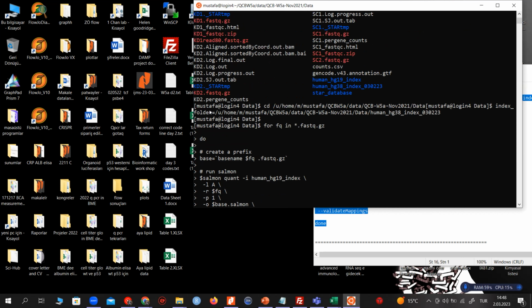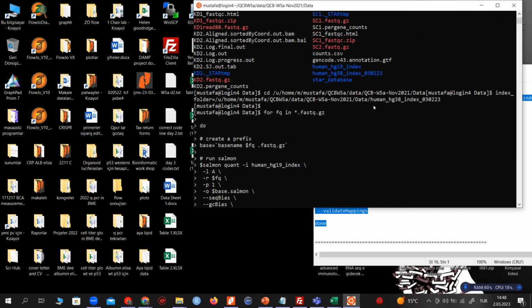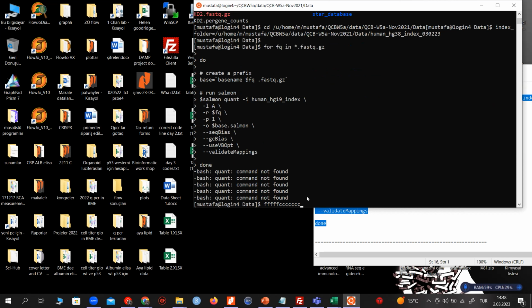Actually, all my data is in the data folder, and I defined the index folder as the data folder, human. But then the error is about the salmon executable. So what did you save as the salmon variable?